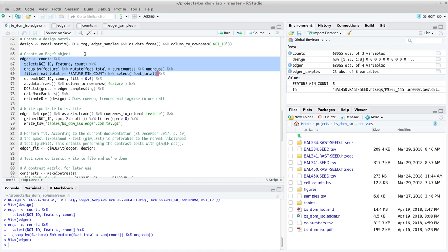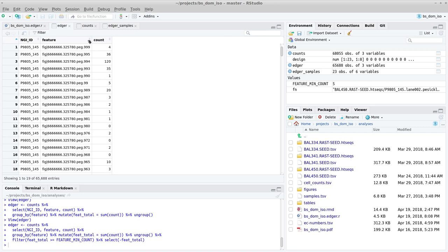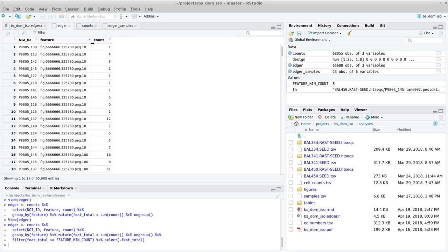So this is what this step does. It essentially just filters using the constant I have already defined here of 5, and then it drops that column because it's just going to hinder us in the next step. We can run that and you can see that we will lose the first feature, then the one that had a 0. As you can see, there is now a feature here which is called 10, which apparently has or clearly has a sum that is larger than 5 over all the samples.